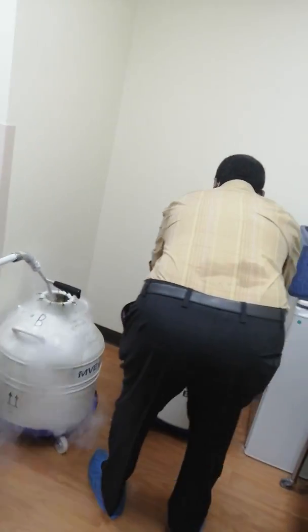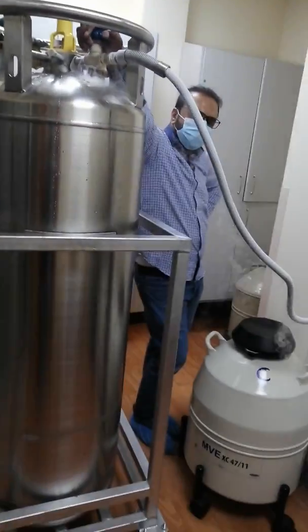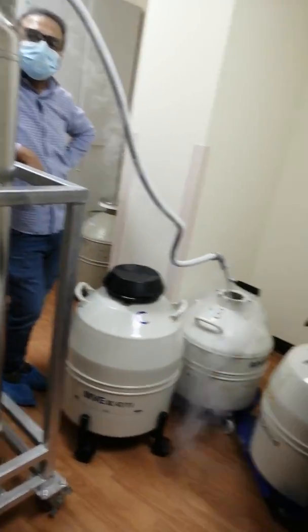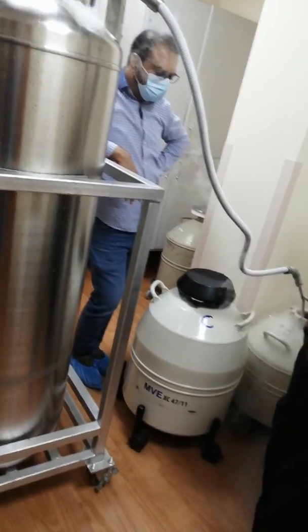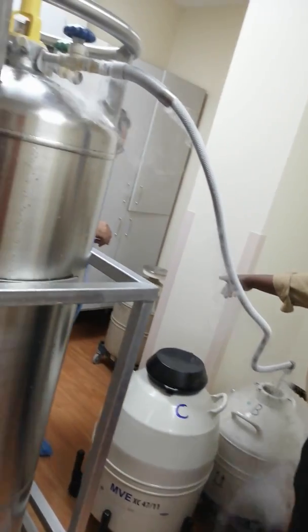This one is better than before. Before, we were bringing old tanks to Tocobar, but now we have new tanks. We have that one, a small one, and also that big one. This is why we use this — we borrowed this one.